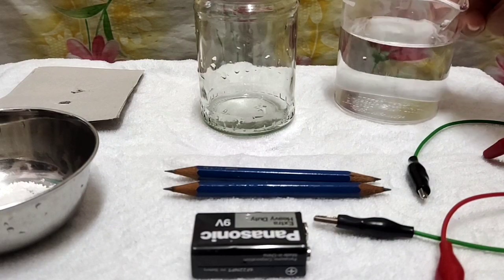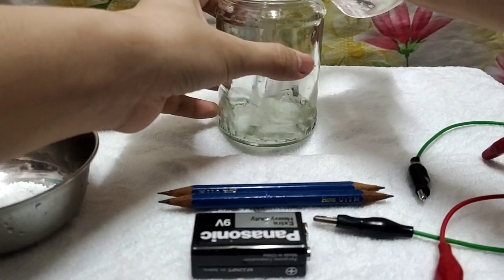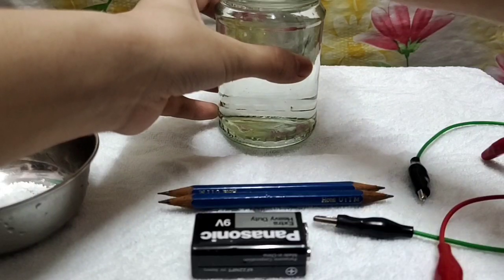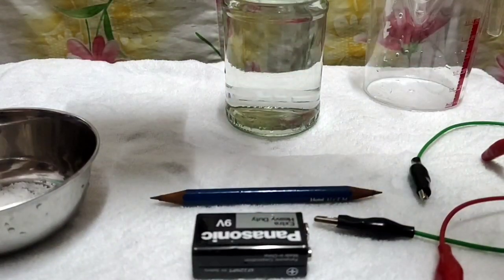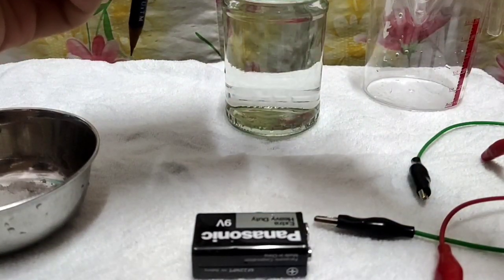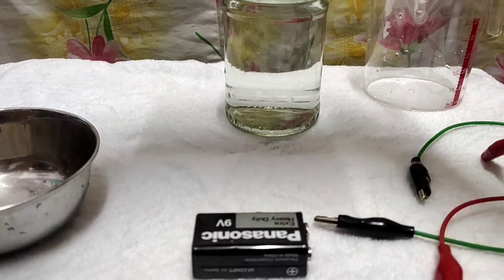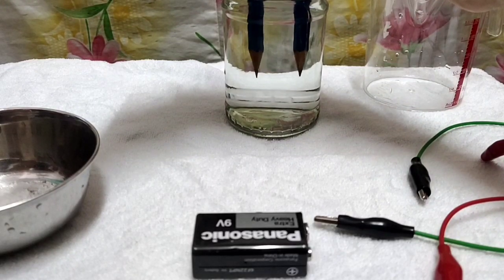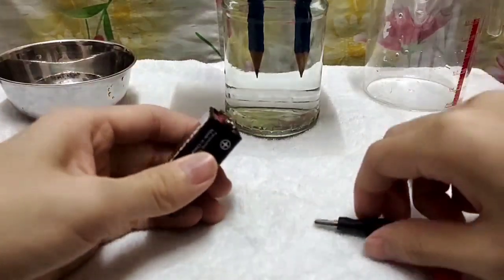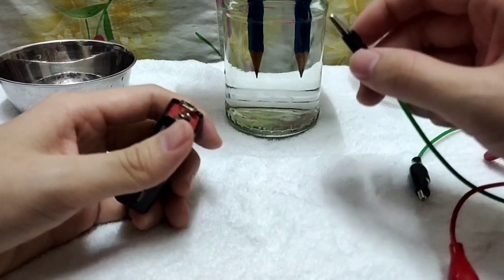So first of all, I will pour 250 ml of warm water into the beaker. Next, I will set up the apparatus by placing the 2 pencils into the holes of my cardboard. And next, I will place this on top of the beaker, like this. Next, I will connect the 9-volt battery with the crocodile clip, the alligator clip, to each pencil tip.